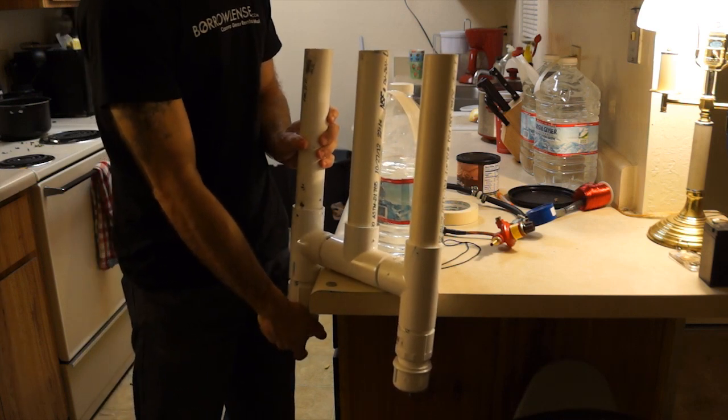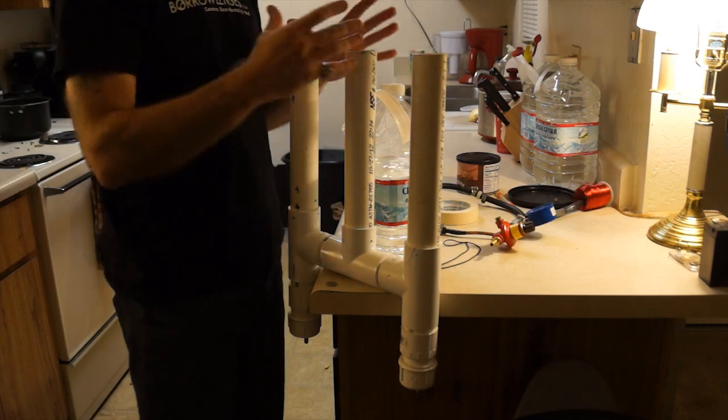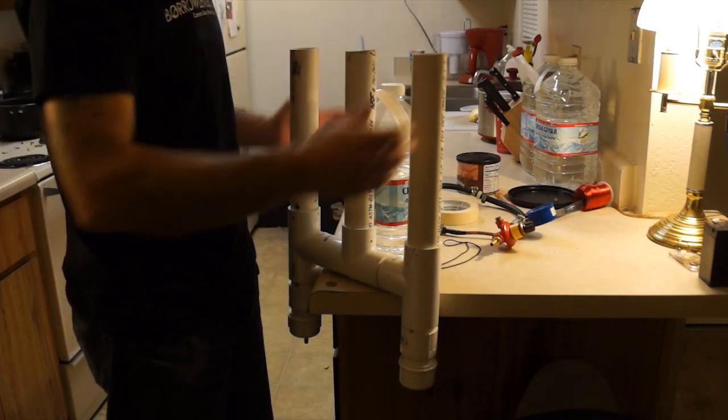But I've seen this system work. This is the original, the oldest system that I've seen work that separates hydrogen and oxygen when they were talking about electrolysis was the Hoffman apparatus.